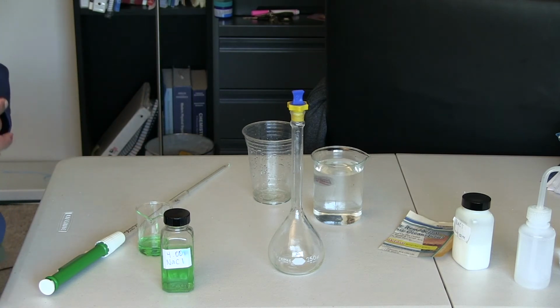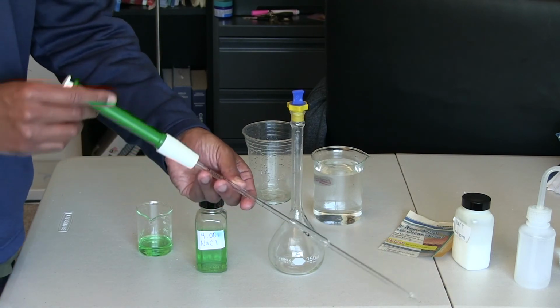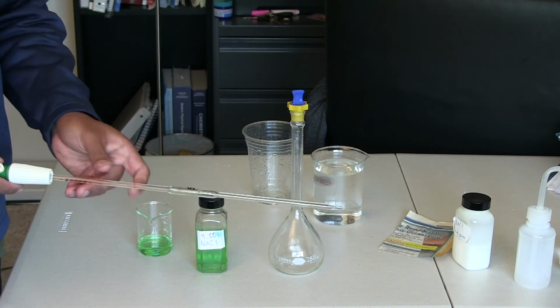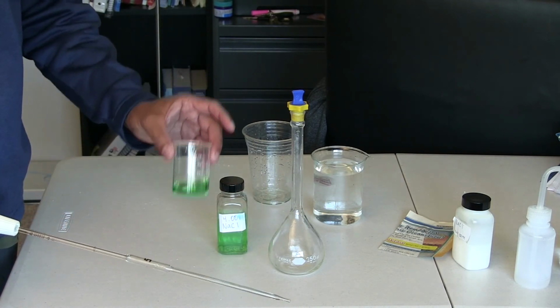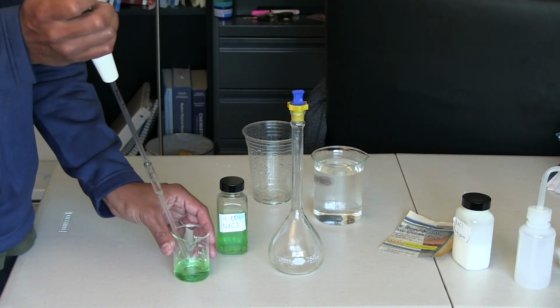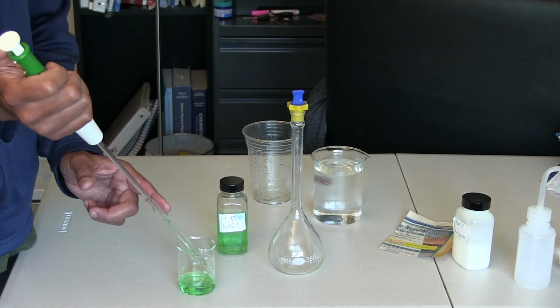So the first thing we have to do here is use what's called a pipette filler and also a volumetric pipette. Normally you're supposed to rinse this twice with water, and also rinse it with the solution as well. So here I pour some stock solution into this beaker, and I'm going to rinse the pipette by withdrawing some of the liquid out. All I'm going to do here is rotate this, and as you can see, I'm withdrawing some liquid inside already.